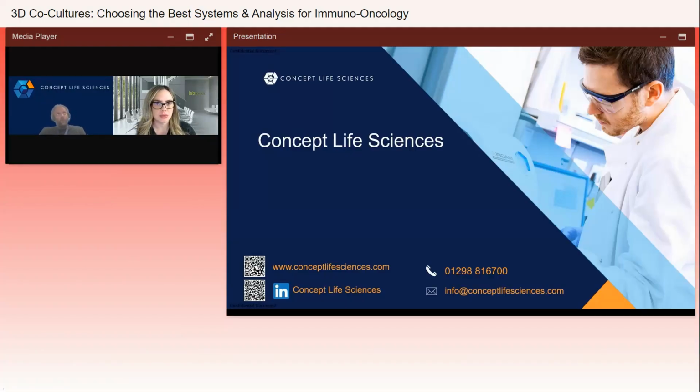So that's coming down to what the cells do themselves. If they're happy without a scaffold, and we're only interested in what they're doing, then I'm quite happy to leave the scaffolds out. But let's say things like A375s, PC3s, and I know things like MDA-MB-231s also just don't like forming these spheres on their own. So you kind of need some extra structure there for them. Like I say, I know for those three, you can add extra bits to the media and they will form it. But it comes down to what you want at the end of the day. What's the question you're trying to answer? If you're looking at spheroid growth, then obviously if they need the extra support, you're going to have to put it there. If they don't, I wouldn't put it there unless you absolutely need it to be.